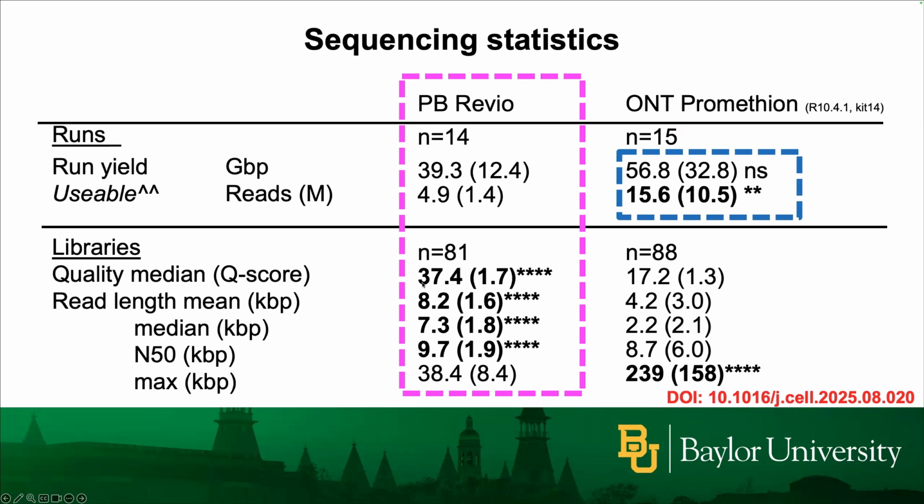But when you look at the quality, the accuracy of the reads, it's 2 orders of magnitude higher than ONT. And especially for microbial genomes, in my opinion, this is really the sweet spot of technology that I just don't know if it will ever be matched. This level of quality really helps when you're trying to assemble very similar microbes or even strains or species within a complex community.